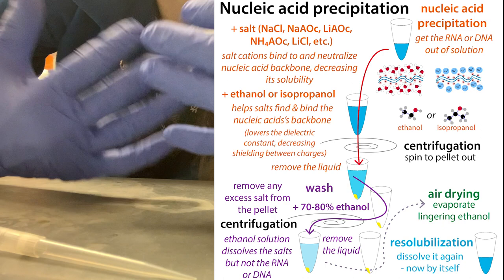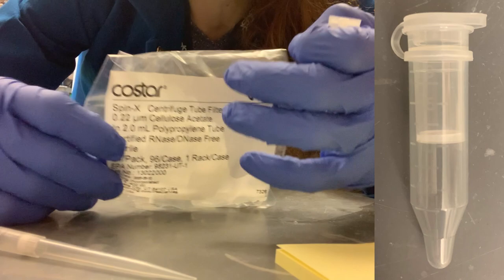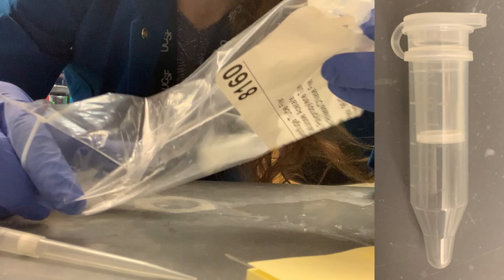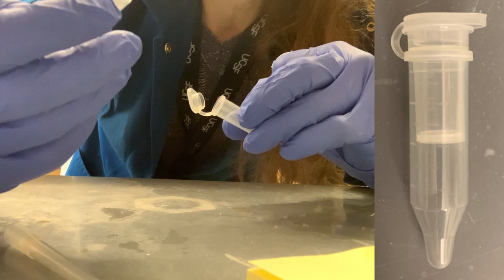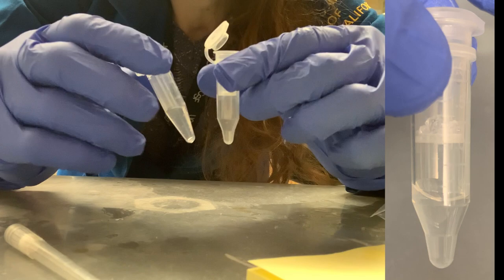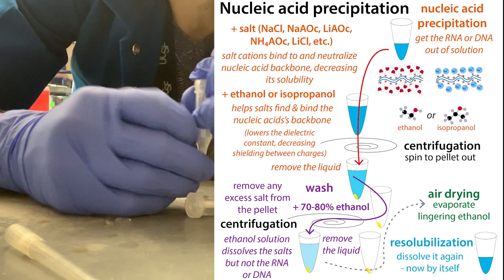For separating the liquid from gel pieces, I like to use spin-column filters — there are other options, like spinning down and removing the liquid, but I find these easy to use. Make sure you're using something like cellulose acetate that doesn't bind nucleic acids; don't use nylon, which will bind them. These filters have little buckets with a membrane on the bottom that filters out all the gel pieces while letting your nucleic acid-containing solution flow through. Pipette your sample into the bucket, centrifuge it, and your sample gets pulled through while the gel bits get trapped.